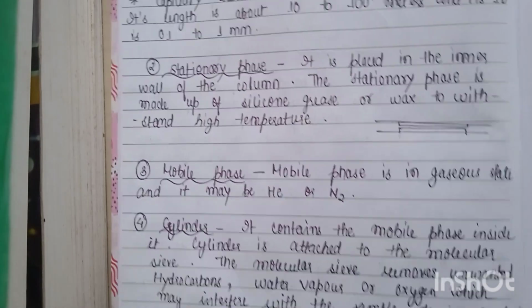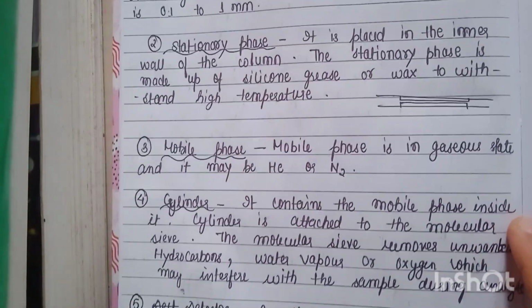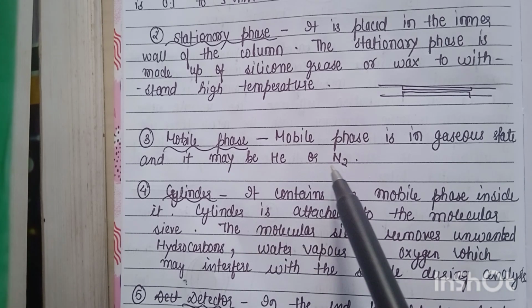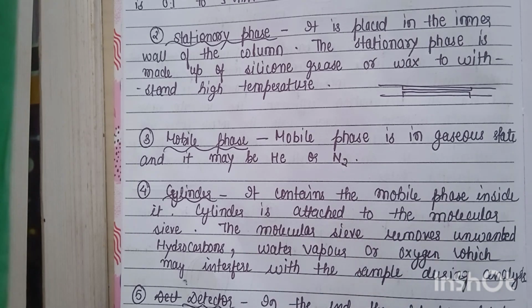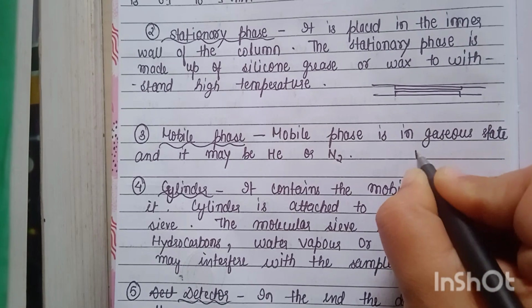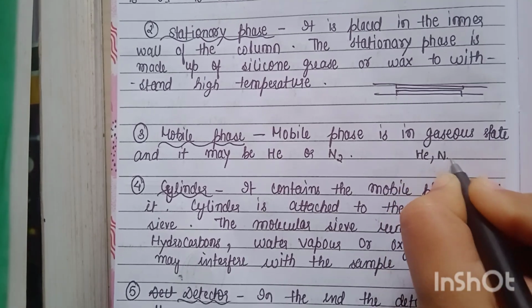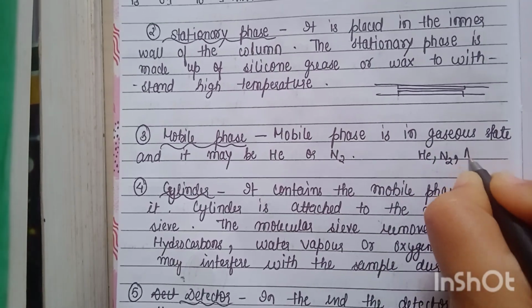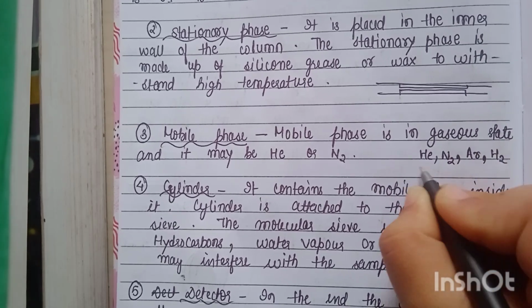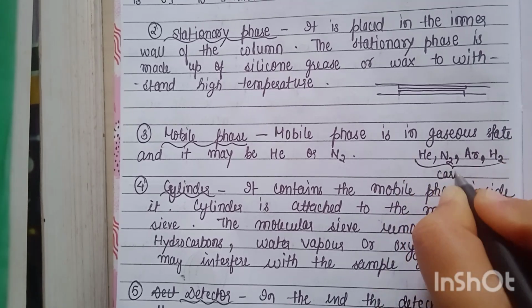The third component is the mobile phase. Mobile phase is in gaseous state and it may be helium or nitrogen. The mobile phase is basically a carrier gas, and the carrier gases are helium, nitrogen, argon or hydrogen. These are the carrier gases.